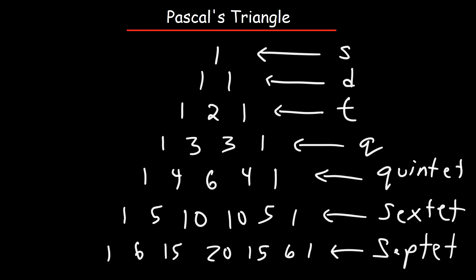It's amazing how some of the things that you've learned in math now come into play with things like NMR. Who would have known that Pascal's Triangle would be related to it? So that's a quick and simple way in which you could find the intensity ratios for the splitting patterns that you'll see in an NMR spectrum. Now let's work on an example problem.